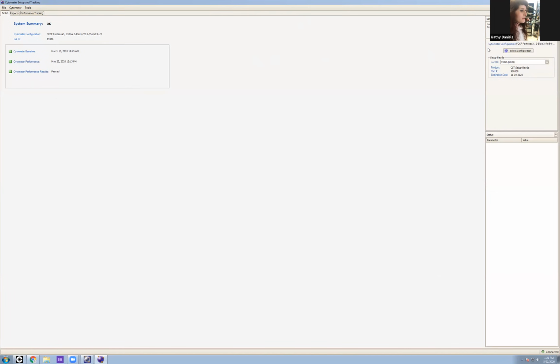And I'm going to grab the CS&T beads that I've already made up, and typically it's about 2 drops of beads and 500 microliters of the diluent, which is the sheath fluid. And I'm going to switch over from a tube that I had of water to a tube of CS&T, and I'm going to load them on before I started in the software, and I'm going to start running it on low. Okay?